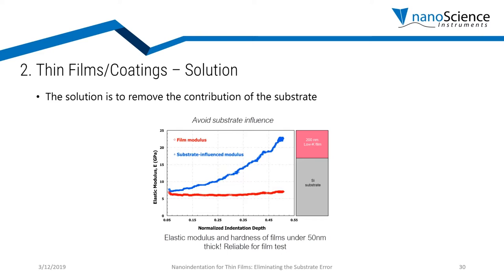Once you apply the substrate correction, you get data that is actually correct. Without correction, the blue curve shows substrate-influenced modulus increasing with depth, which makes no sense since the material is the same. Other commercial nano indenters without CSM can only measure one point on this blue curve, giving a wrong and inconsistent property value depending on depth. Measuring at different depths gives different numbers, making you think you have a different product when you do not. With the KLA thin film solution applying the correction, you get the red curve — the true properties of the thin film.